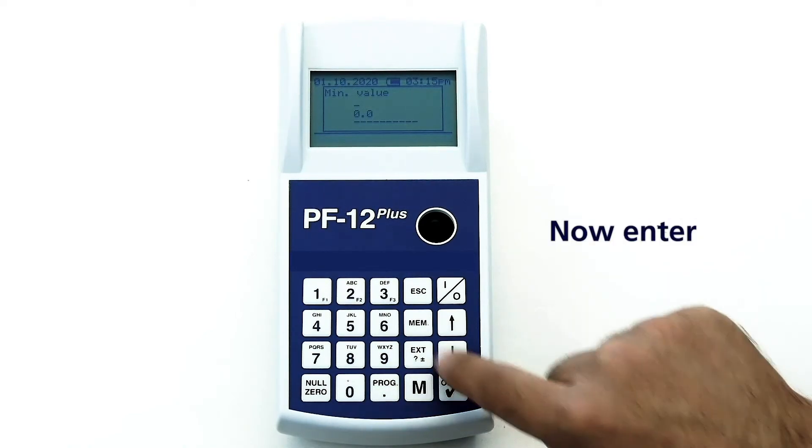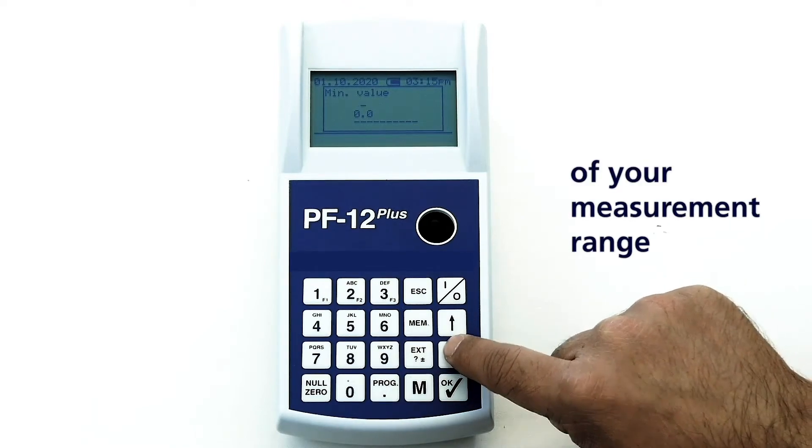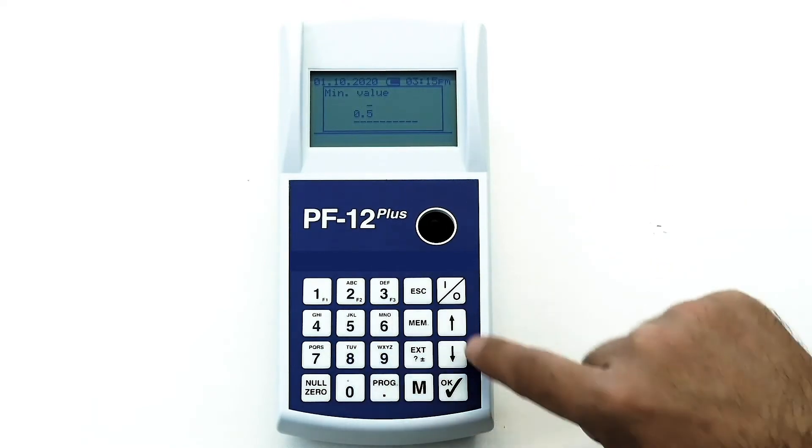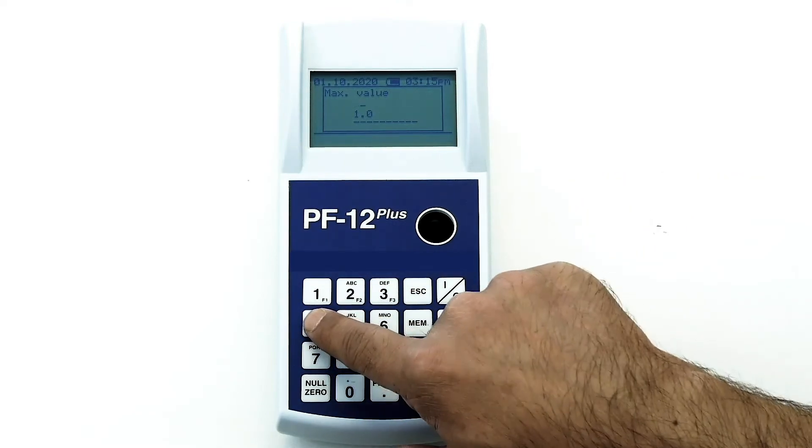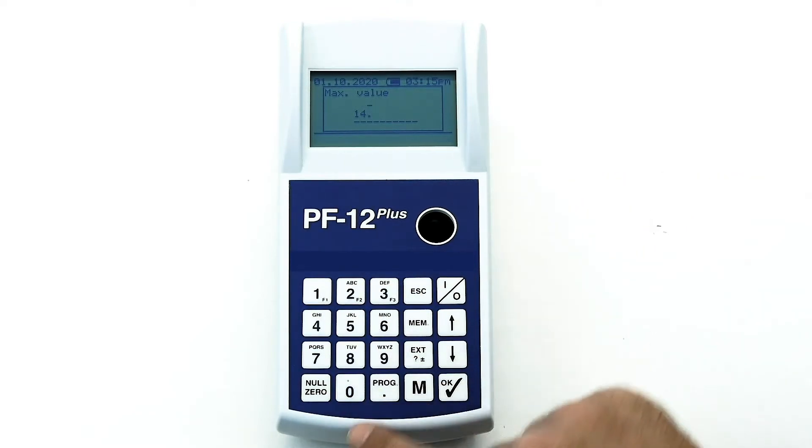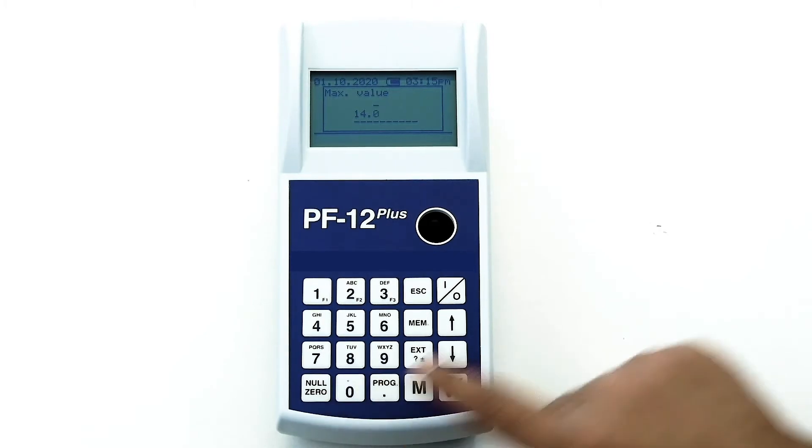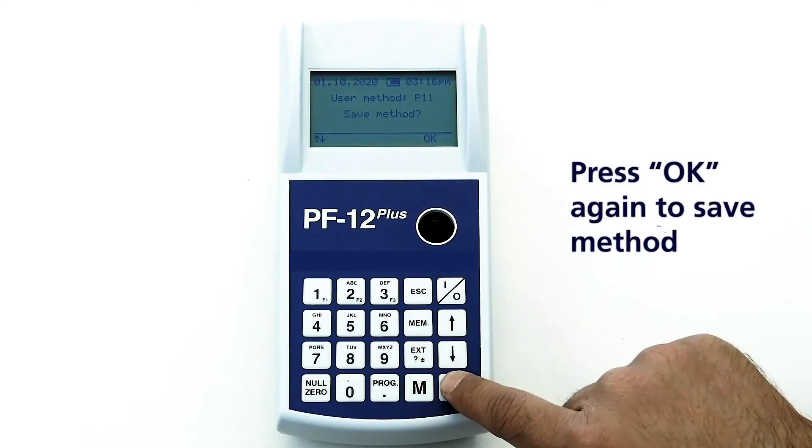Now enter the minimum value of your measurement range. Enter maximum value of measurement range. Press OK. To save method press OK again.